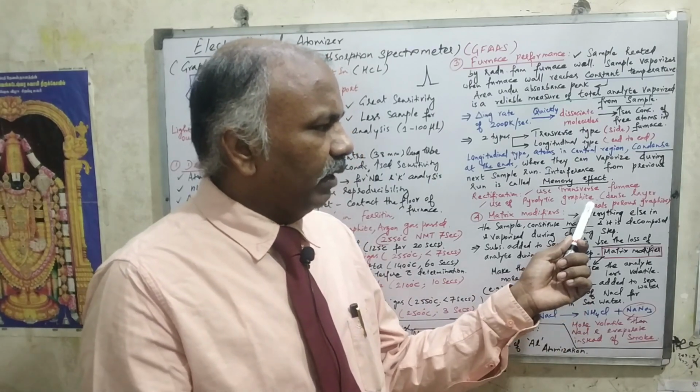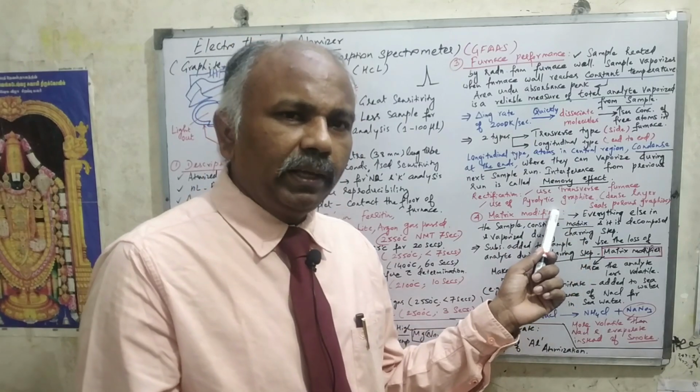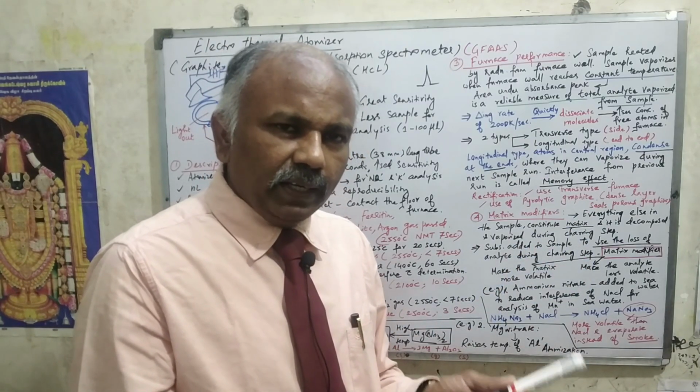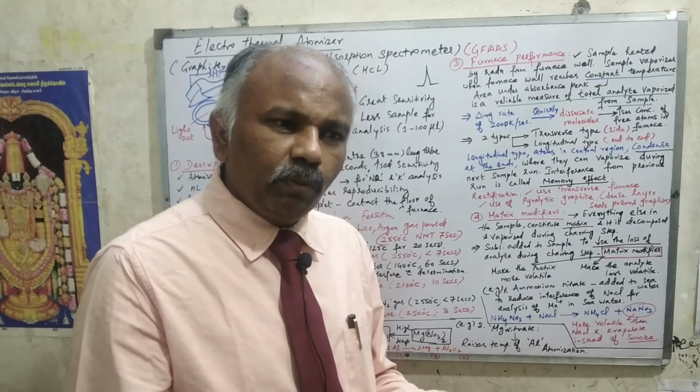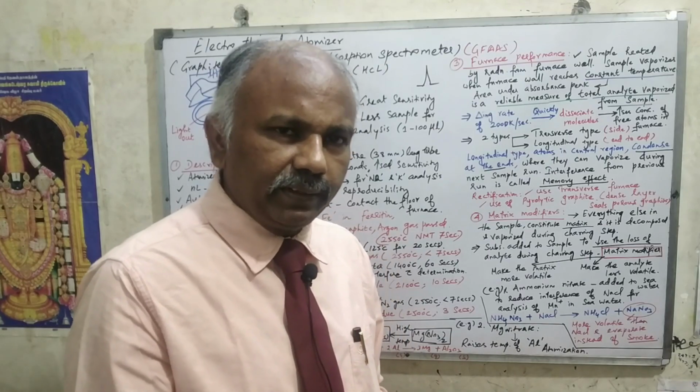It will seal the porous graphite. So we use pyrolytic graphite in the longitudinal graphite furnace, whereas the transverse furnace is the better one if you are using it directly. This is the rectification method for avoiding the memory effect, right?